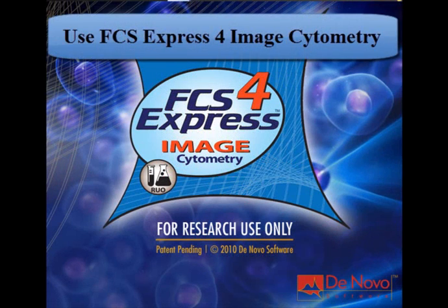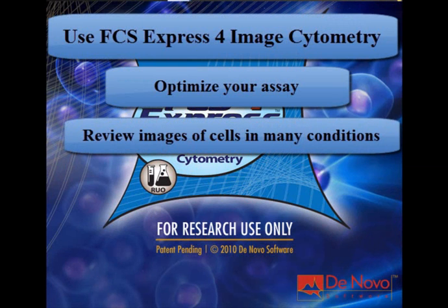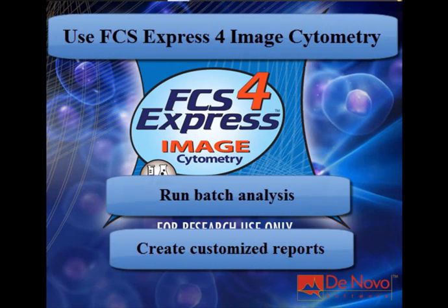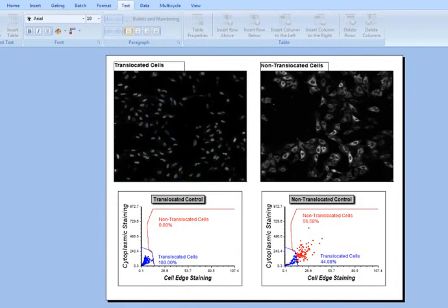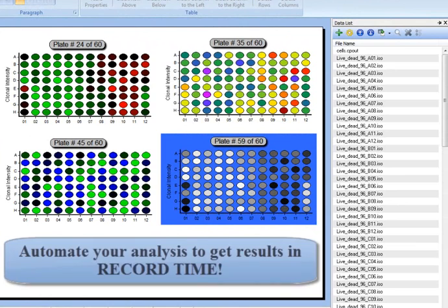In this demo of the image cytometry features, we have optimized an assay, reviewed images of cells in multiple conditions, run batch analysis, and created a customized report. Whether you are looking at single, several, or hundreds of images, FCS Express 4 Image Cytometry can automate the data analysis process to get you results in record time.